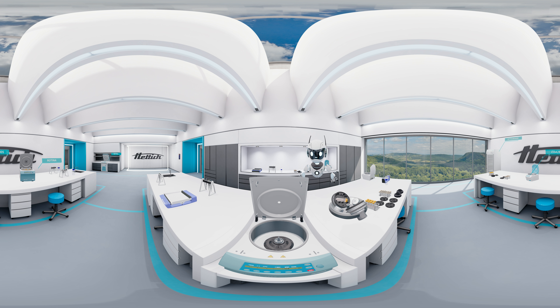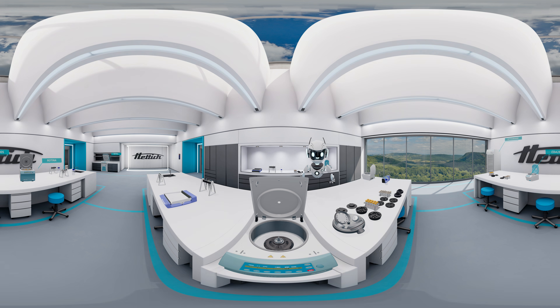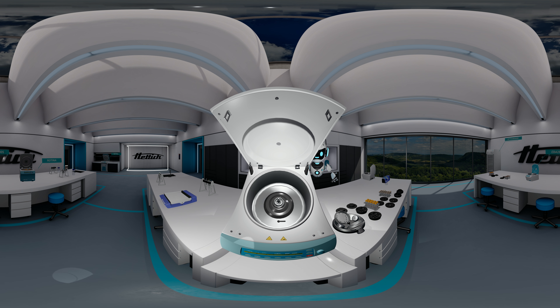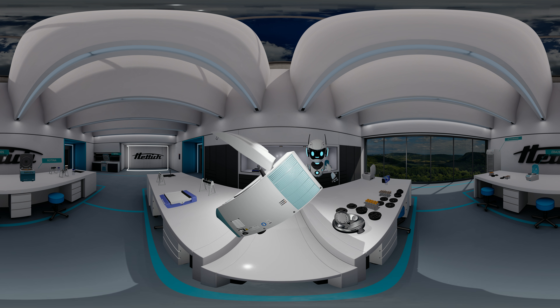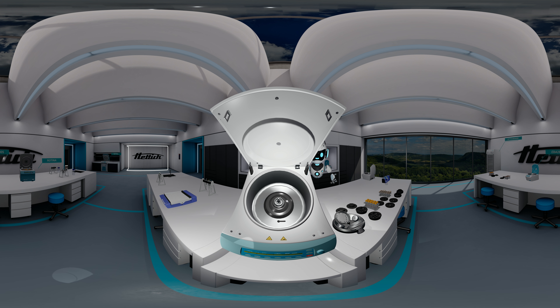Let us take a closer look at the components, which comprises the Zentromix basic device, the Zentromix rotor, and of course all the adapters to accommodate various types of sample containers. This is the basic device, the Zentromix body. This device is able to accommodate the Zentromix rotors as well as normal centrifuge rotors.